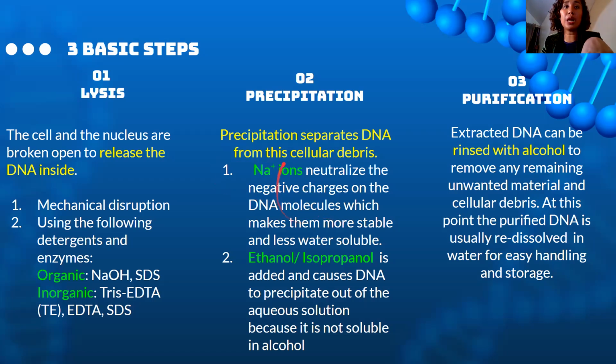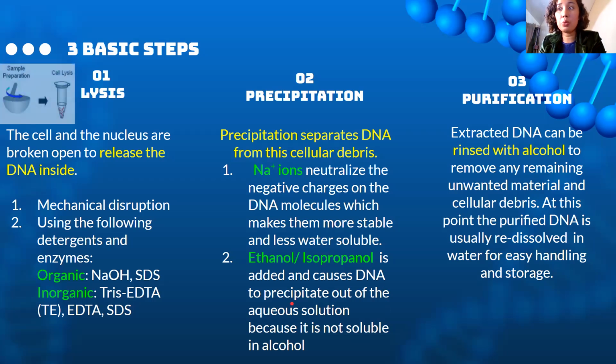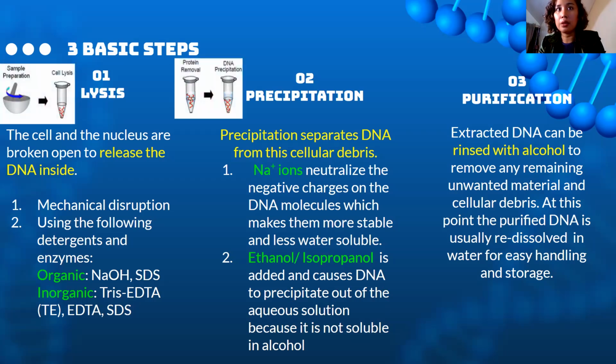So that it would be neutralized, you can add sodium ions, okay? And make it less water soluble so it precipitates, okay? So that it doesn't dissolve. And we could also add ethanol. So ethanol is a dehydrant, right? Or isopropanol. So these alcohols are dehydrants. So it could also cause the DNA to precipitate out of the aqueous solution. So that the DNA gets separated. So ethanol and isopropanol are used.